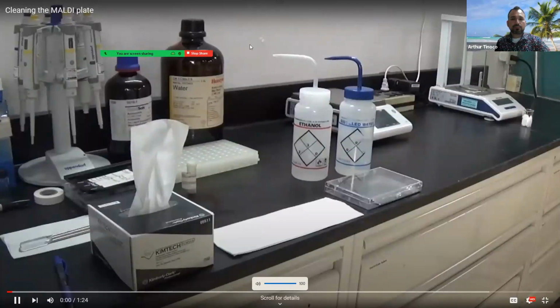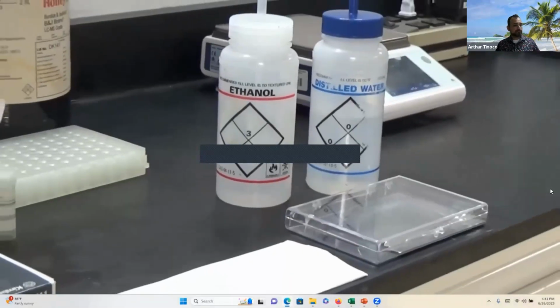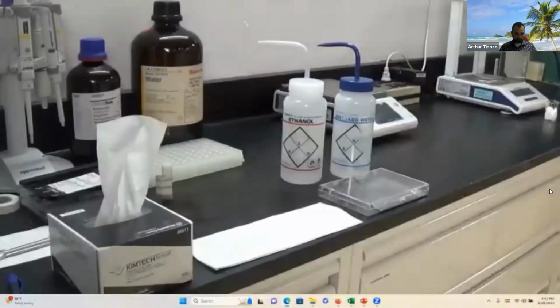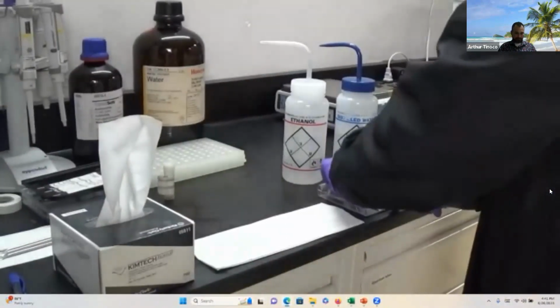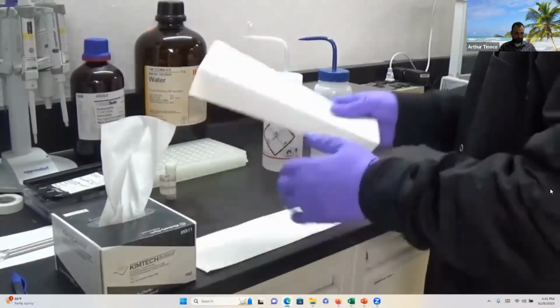In order to clean the MALDI plate, you will need 2 basic solvents, water and ethanol. Please make sure that the water quality is distilled water. The first thing you'll do, as you will see, is wash the plate with some water and use a Kim wipe to rub down the surface.